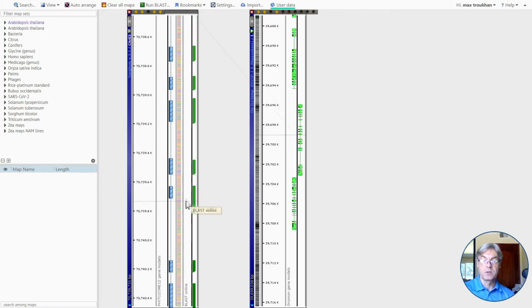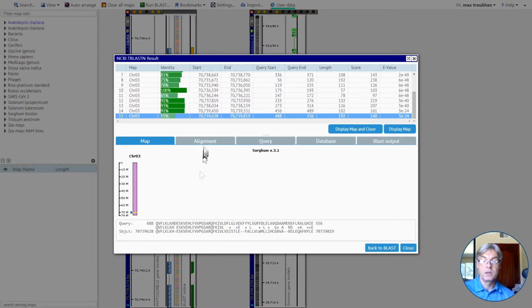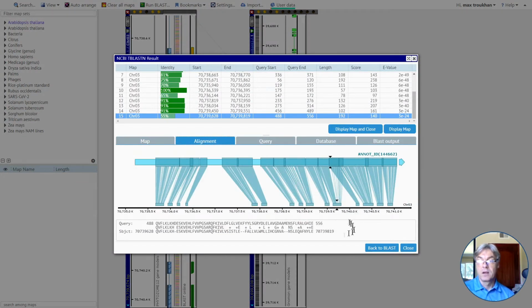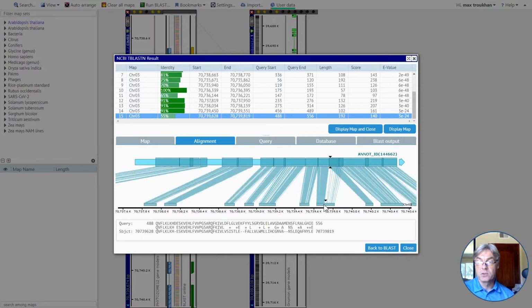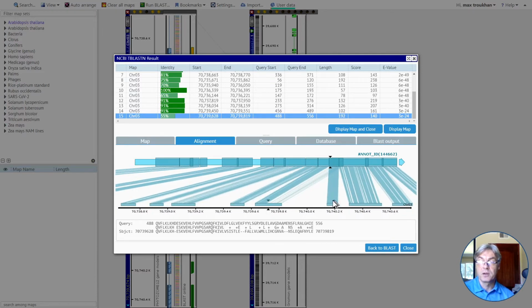What's going on? So this may confuse your algorithm if it takes into account the protein hits. So if you click this one and look at the alignment, you will see, aha, something is going on. So you have this hit, but it's sort of uneven in its density. So it's probably just one random hit, but the original part of the protein matches much better in this area.